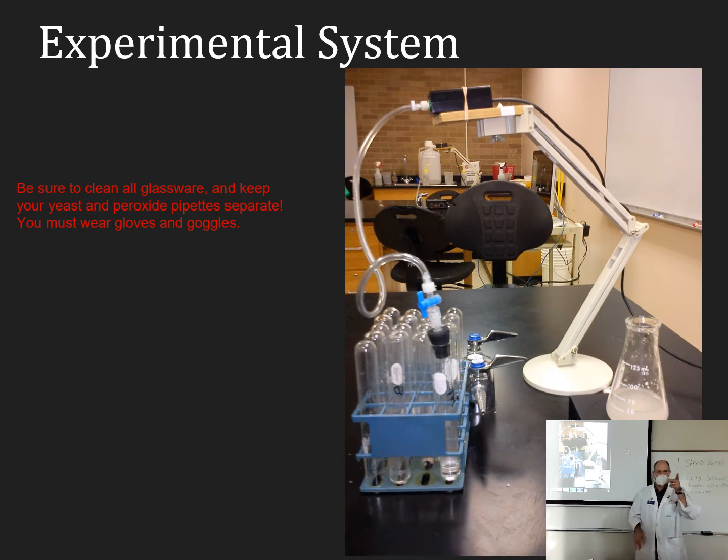I'm going to do that demo in just a second. I'm going to have to get a knife or a pair of scissors out. What we're going to do is a demo with some liver to see this reaction in action and talk about it. And then we're going to get ready and set up our experiment. But I'm going to go ahead and do most of this video here first, and then we'll do the demo, okay? Maybe we can do one of the demos on the video.